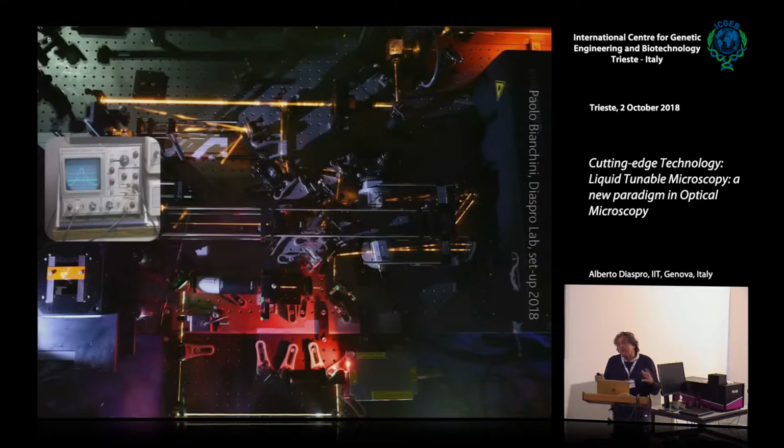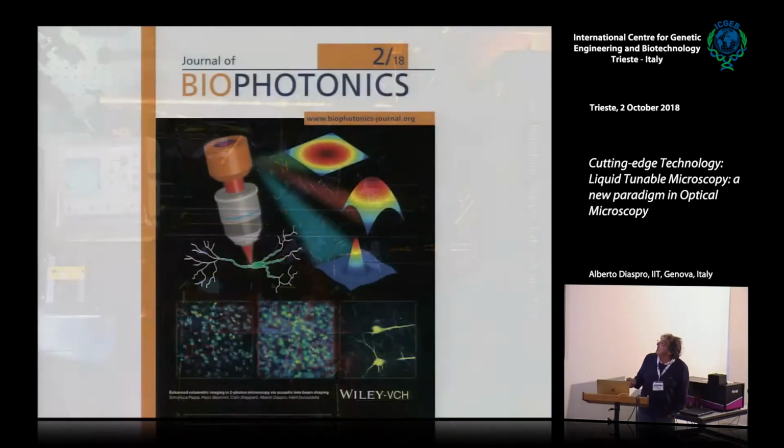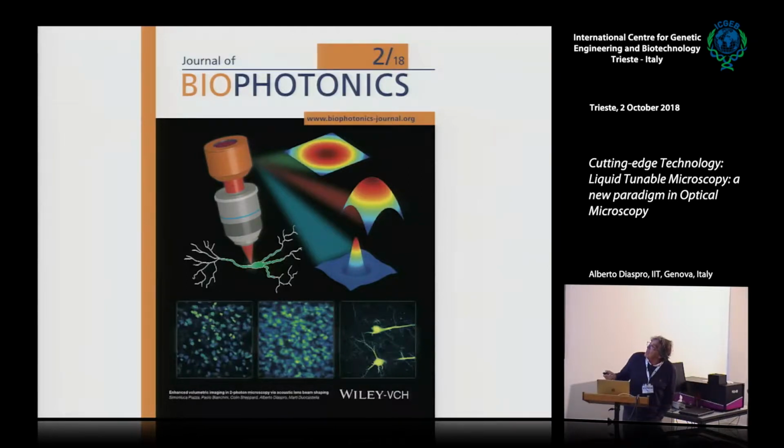And there is one point that is very interesting: the way you shine light on your sample. You would like to be flexible in the way you do this. Simon Luca, for example, for his PhD thesis, developed a very good job and was able not only to work with this special lens that I will discuss with you in a few minutes, that is a liquid lens, but please keep in mind that liquid tunable microscopy is not related to the liquid lens. By chance, the name is liquid tunable microscopy and the lens is liquid.